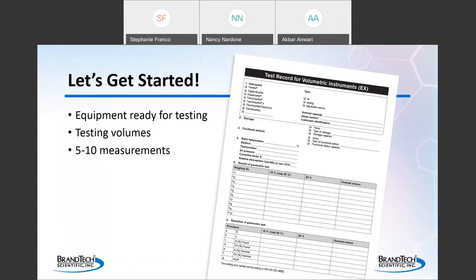I don't know how many of you are online shoppers or if you bother to look at product or seller reviews, but if you do, do you get a better feeling with 5 reviews or 50 reviews? So for testing an instrument, 10 measurements at each volume is a good compromise between getting enough data for the analysis to be reliable without it being so many measurements that the process is cumbersome.